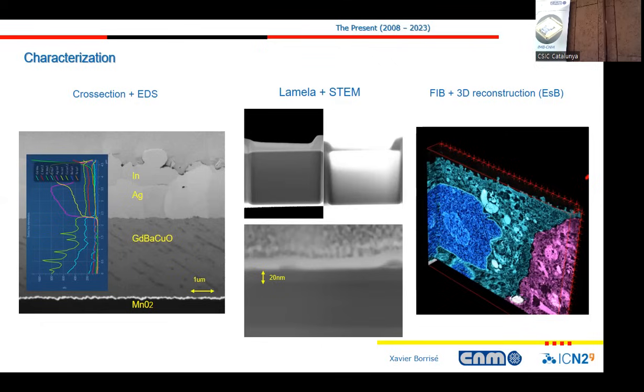Should check that. The idea here is basically that we are making slices with a focused ion beam at a known distance, a few nanometers, and then we can reconstruct everything in 3D. I'll show you later, but the idea here is that they wanted to see if the membrane of the cell was all around the silicon pillar that will appear here. Okay, we see that.